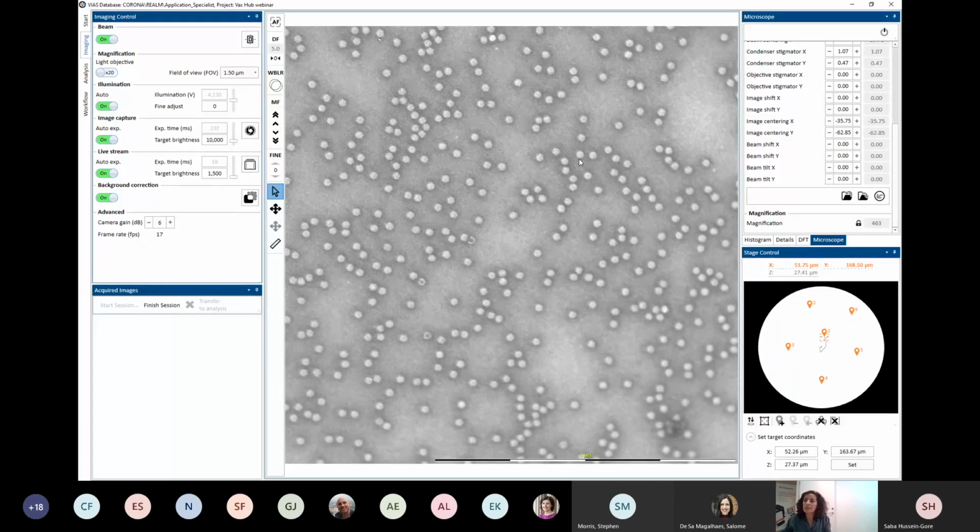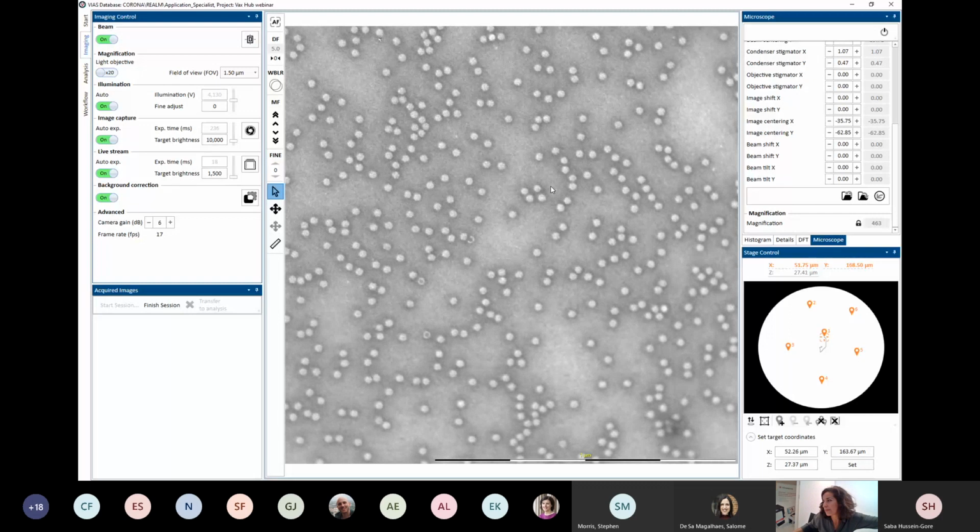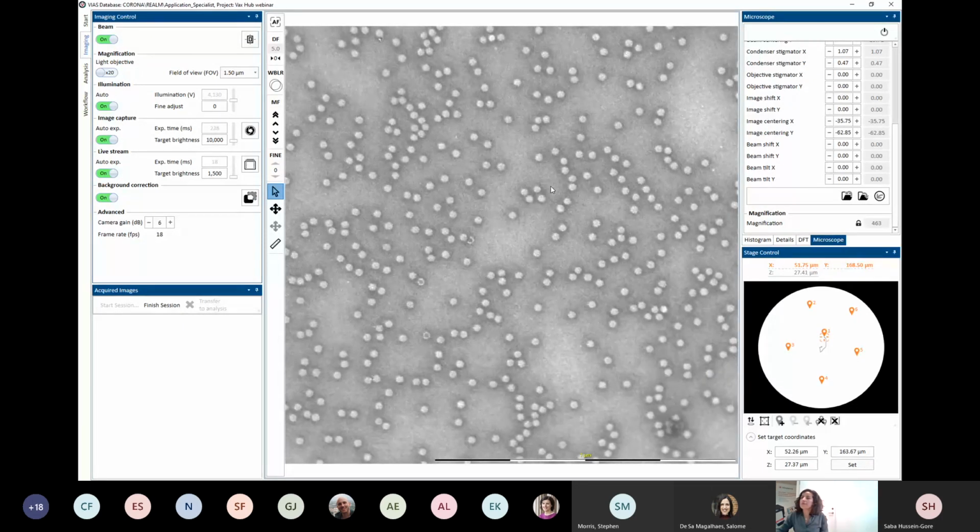So this sample is pretty good, because most of our AAVs are intact, and we only have a couple of AAVs that are non-intact, that are broken. I'm just going to adjust this thing here, like that. And we can take an image of this, and we can do some manual annotation of this if we want.